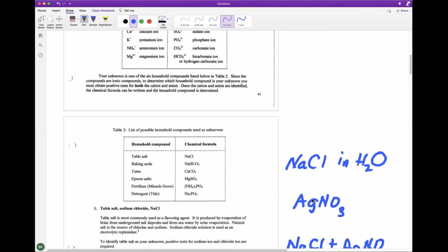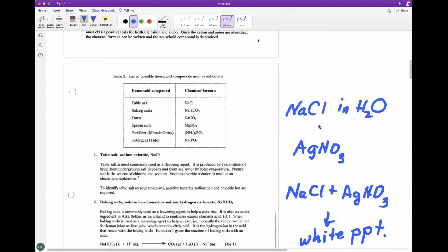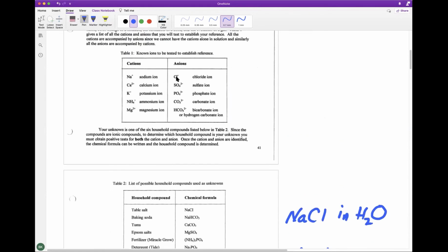But we know that when we're looking for chloride, we can add silver nitrate to make sure if we have chloride in that solution. If we have something else, then we're going to see something different. So instead of testing those other things with silver nitrate, we'll do a series of other tests. For each of these things on our list, we'll have a specific test that only finds that particular ion in the solution. And then we can specify, yes, I have that particular ion in my unknown.